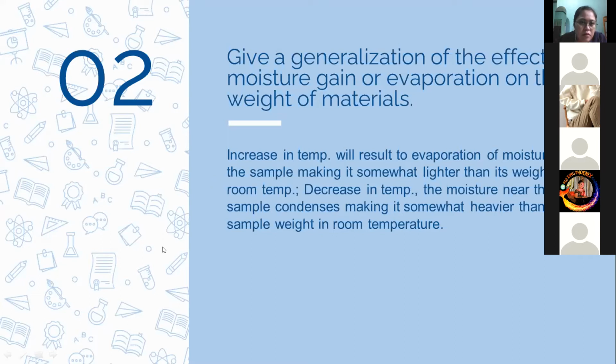So if the temperature increases, the moisture near the sample will evaporate, so it becomes somewhat lighter in weight.